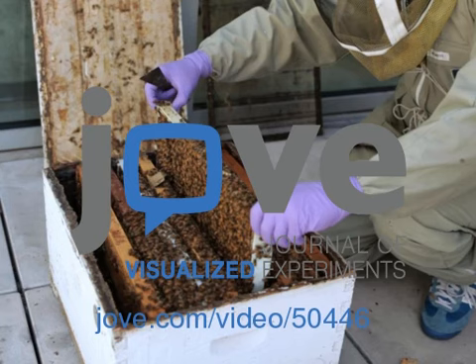However, if the 2-day injection strategy is used and only the first double-stranded RNA has been injected, place the bees in a cylinder mesh cage with honey supplied on the side. Keep the bees in an incubator at 34 degrees Celsius and 80% humidity overnight. On the following day, inject the same bees with the second double-stranded RNA using the same procedure as for the first double-stranded RNA. Let the bees recover at room temperature for 1 hour in a container with honey supplied and then introduce them into a colony.